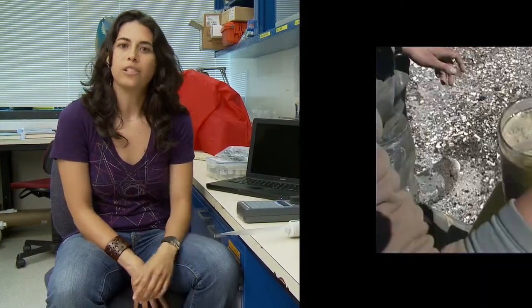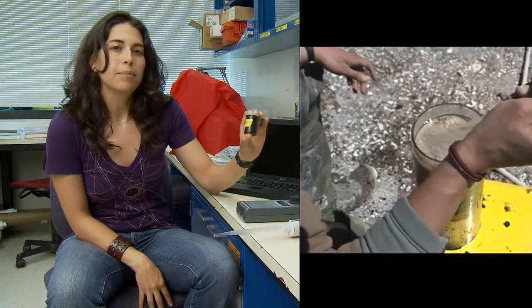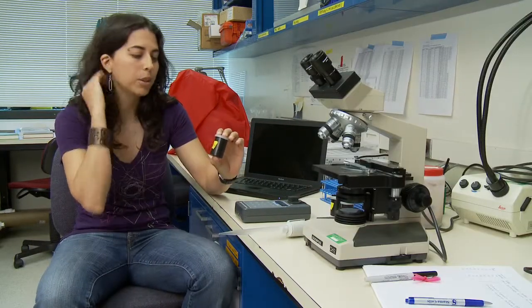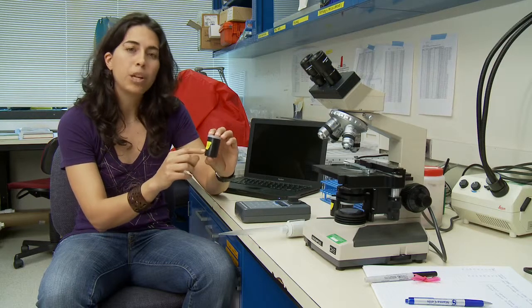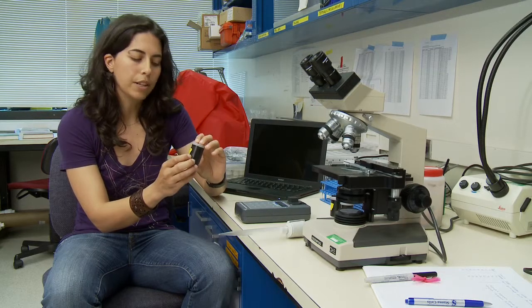As soon as I get to the lab, the very first thing that I want to look at are the algae samples that we took. I've got the algae samples right here. These are the samples that we took on those filters, and we put them in these canisters so that we can do what's called an extraction. Basically, we're putting them in a bath of ethanol that will then extract the chlorophyll from those algal cells that are on that filter.